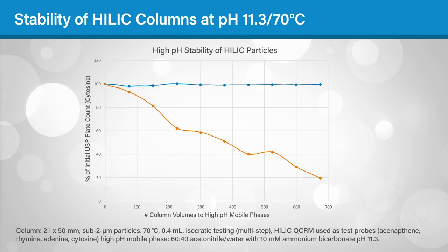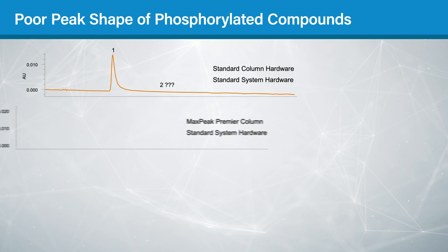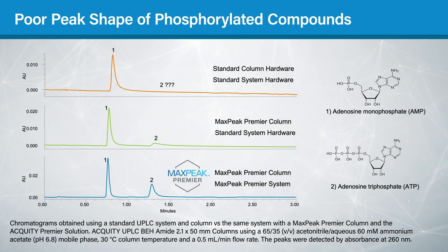One other challenge in HILIC method development, particularly in the analysis of metal-sensitive compounds, is poor peak shape due to interactions with the metal surfaces in both the LC system and the column.